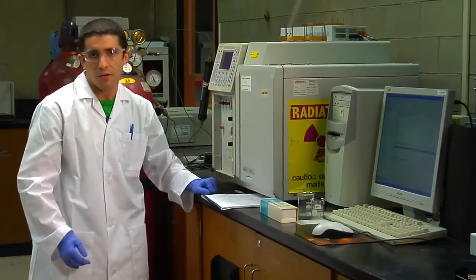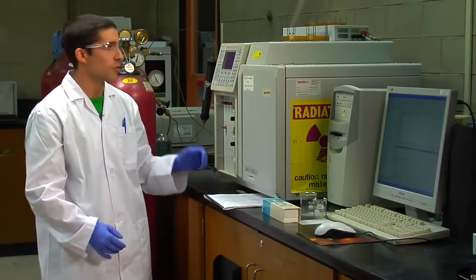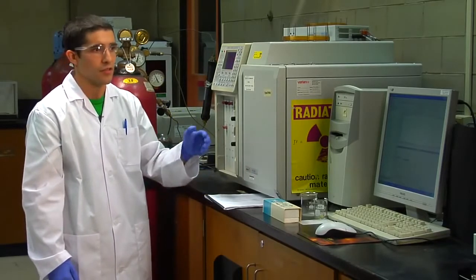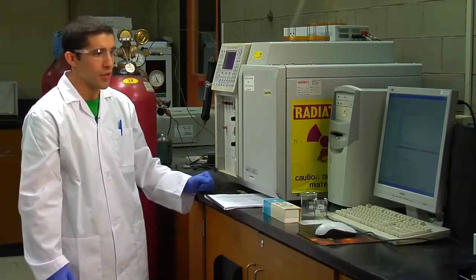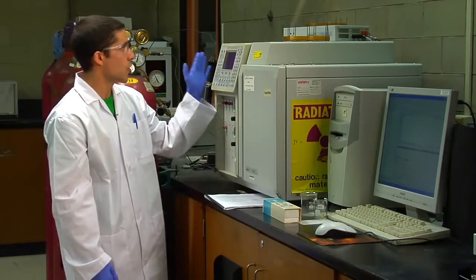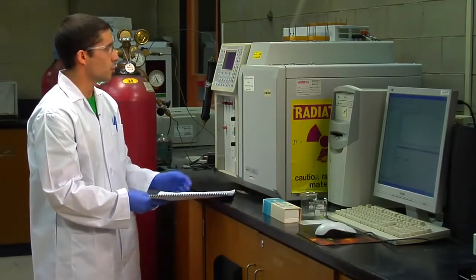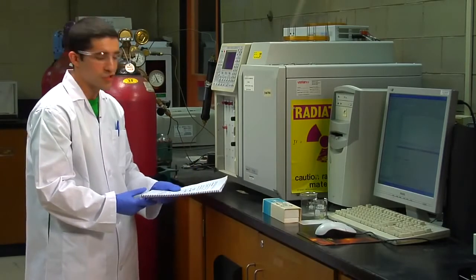To prepare for an injection, you have to make sure that both the gas chromatograph and the instrument software are ready to perform an injection. So I'll first start with the gas chromatograph and set it for a particular program for the separation of PAH sample.